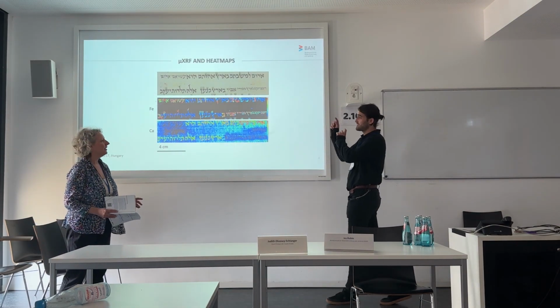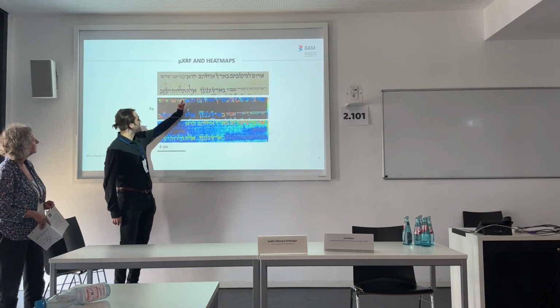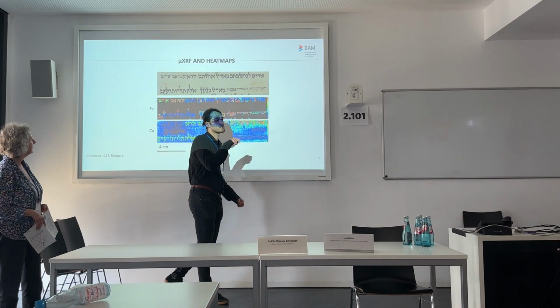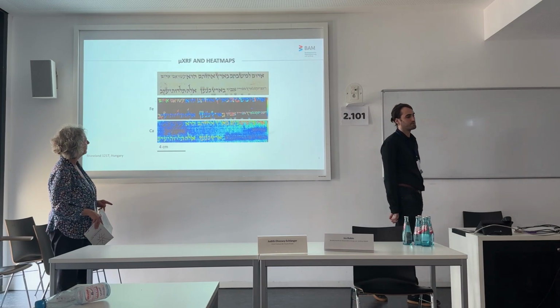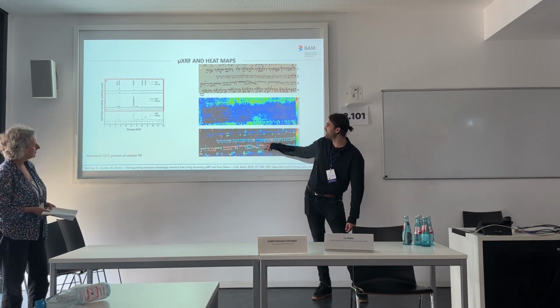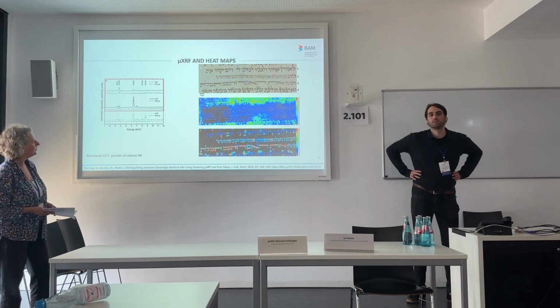Thank you very much. More than that, this also gives us one other hint about the process of writing. The previous example was better, but even here we can see how the intensity of iron is reduced towards the end of the letter. We can see how, in some instances, the tool was dipped and then used for writing, and at which point the scribe was. And you see the periodic changes. I think this is better represented here, actually. If we look at this, for instance, there are periodic changes where the scribe is running out of ink and then introducing more iron.